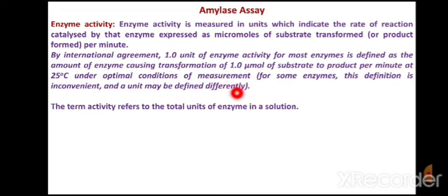This is how the definition of enzyme activity is generated. So the term activity refers to the total units of enzyme in the solution.